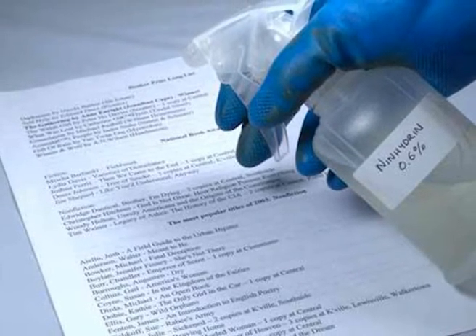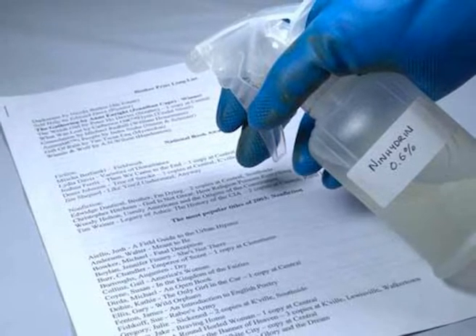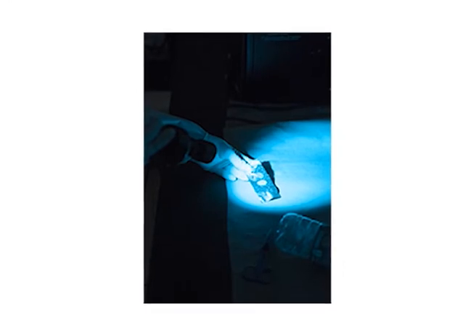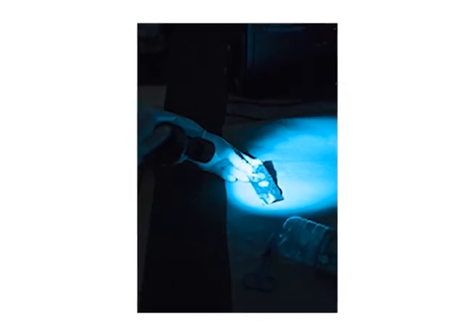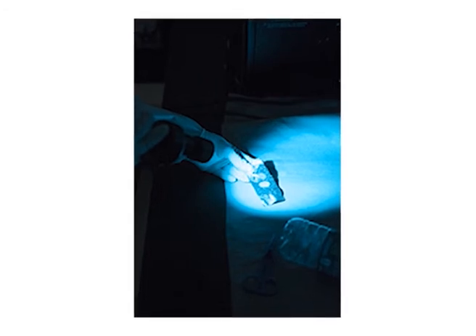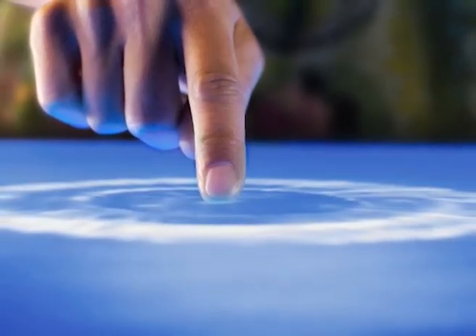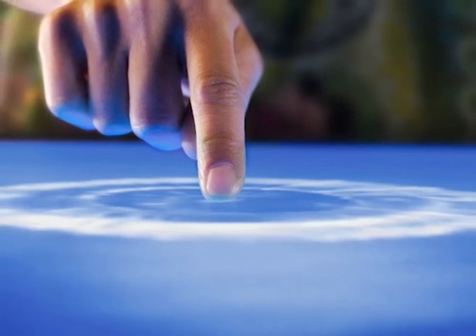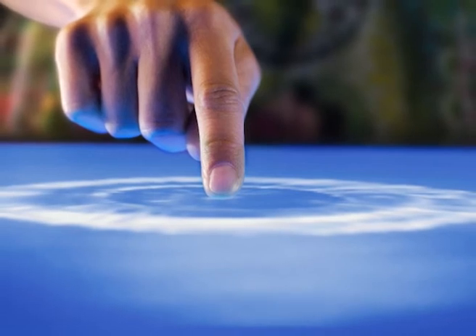The DFO method has the following demerits as compared to the Ninhydrin technique. A high-powered light source with appropriate filter must be available for observing luminescence of DFO developed fingerprints. Otherwise, weak impressions will not be detected. If the surface on which latent fingerprints are to be developed shows background fluorescence, the utility of the DFO method is curtailed.